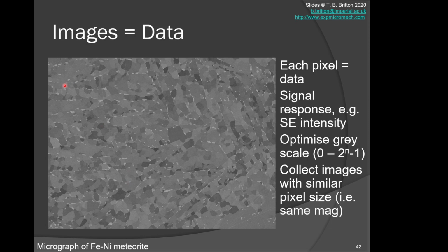The next thing is you can see there is a grayscale variation of the different grains within the BCC, and that's due to the different crystallographic orientations. Importantly, this image is grabbed on a detector, which is simply counting the number of electrons hitting it. Then we represent it on our screen, which is a color screen, what we call a 24-bit image.